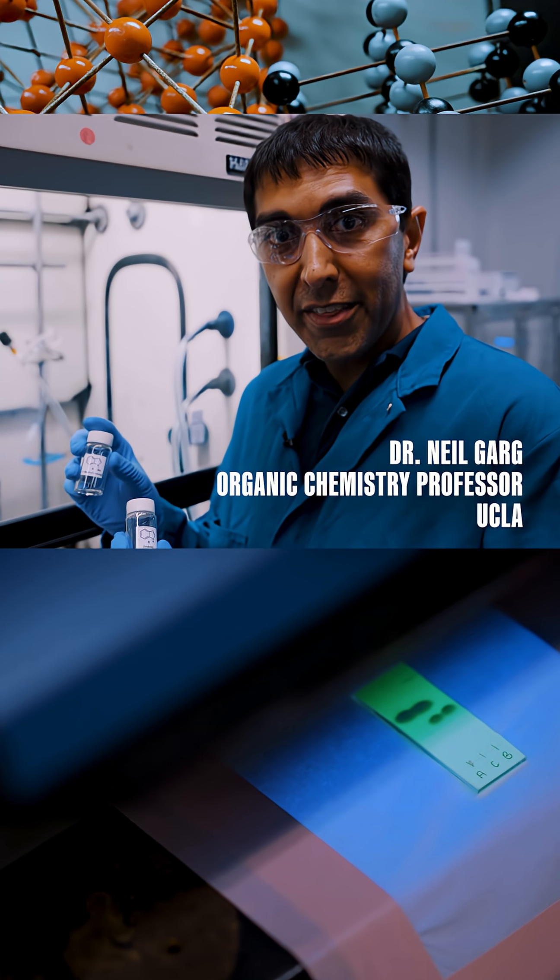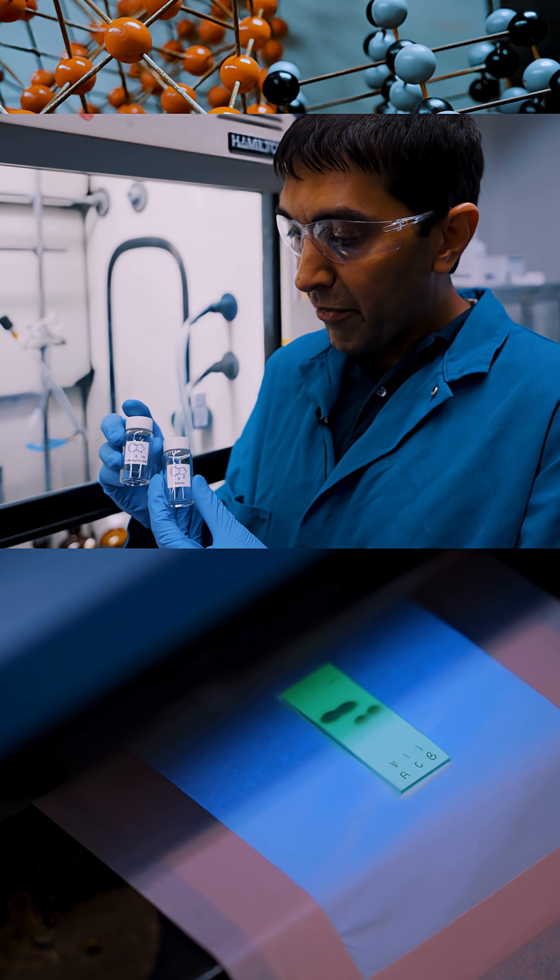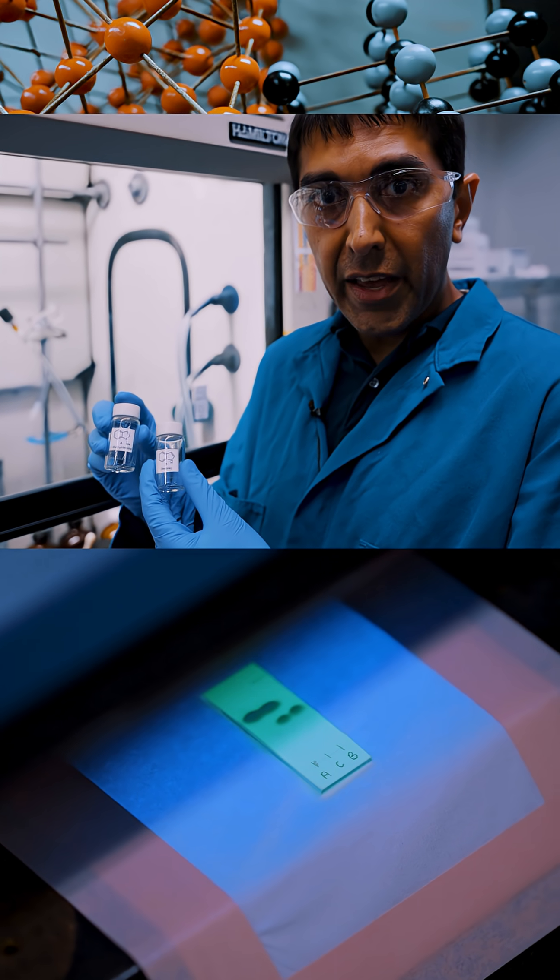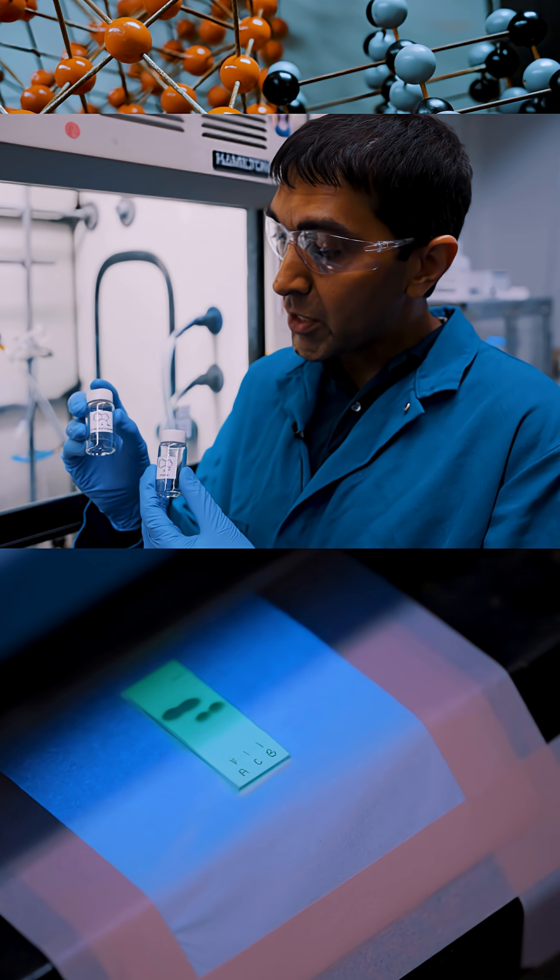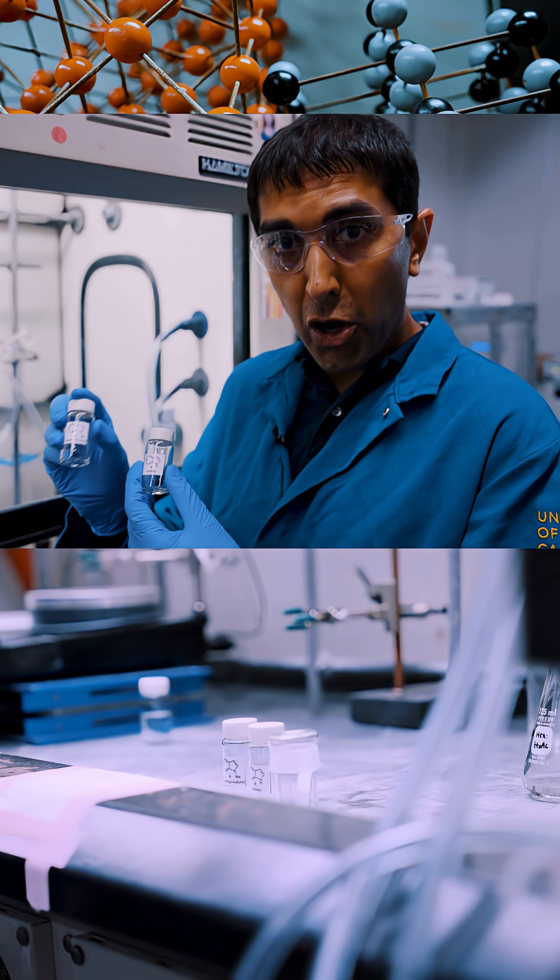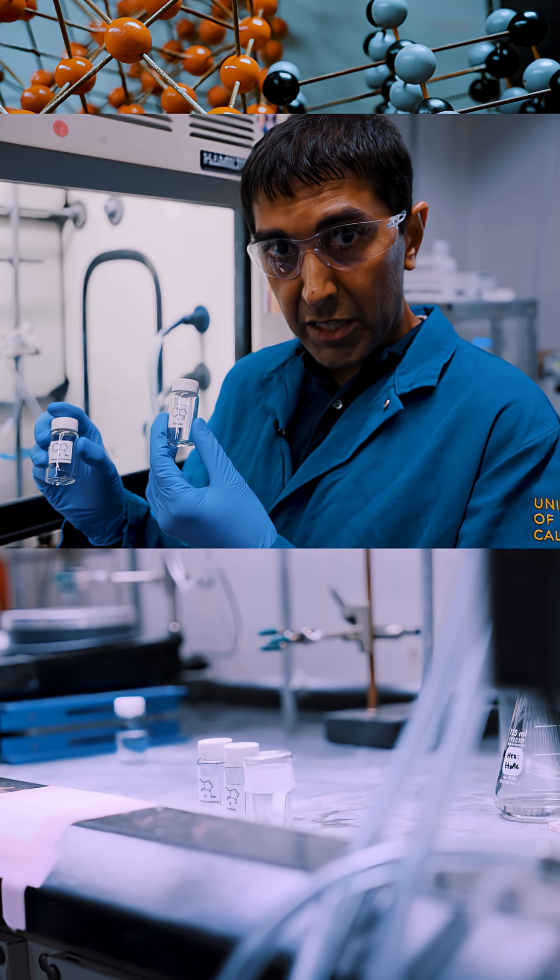We're going to show you a demonstration and this involves chromatography. What we have here are two vials and they have two chemical structures. This one has an additional carbon compared to the one in this vial over here.